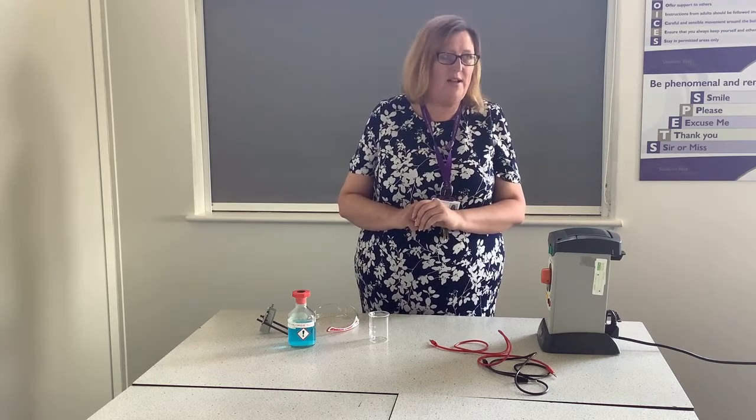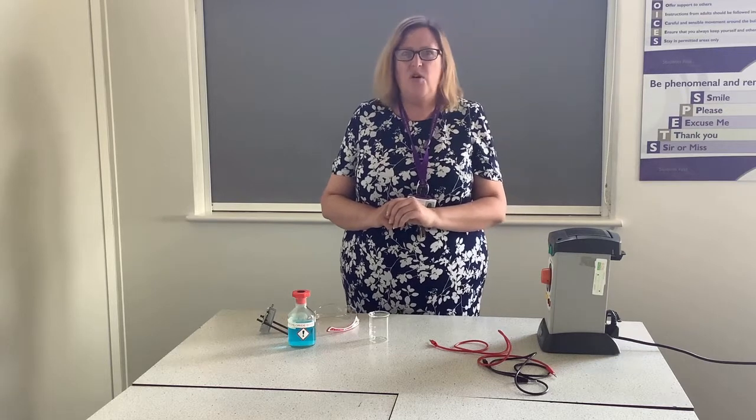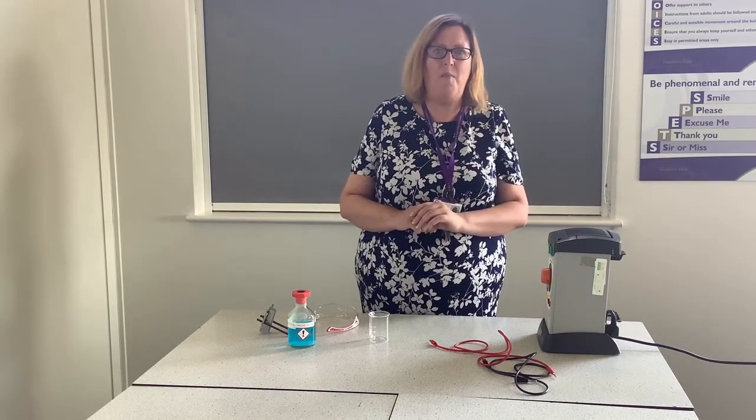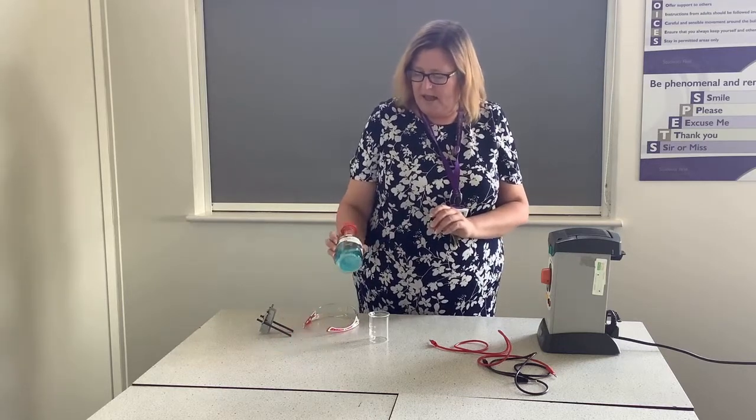Hello, my name is Mrs Chiverton and I'm here today to demonstrate electrolysis, one of the required practicals that you need to know. Electrolysis is using electricity to split up an ionic compound, and the first substance we're going to look at today is copper chloride.